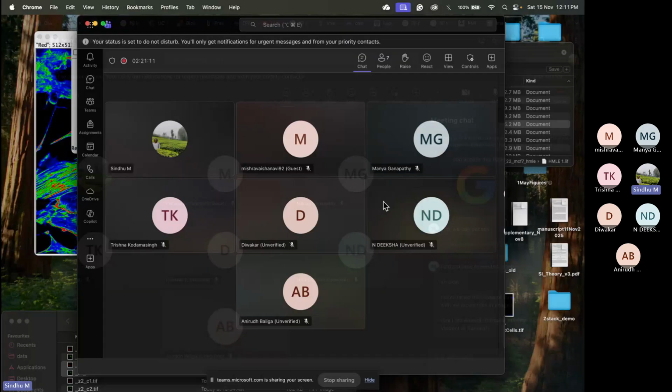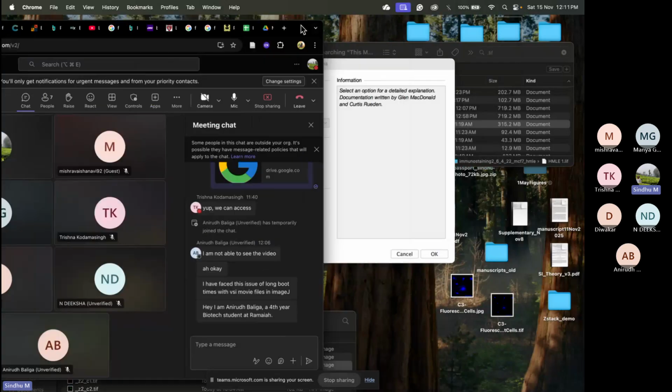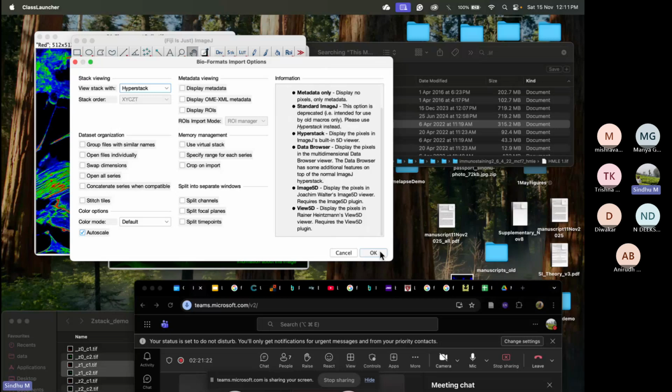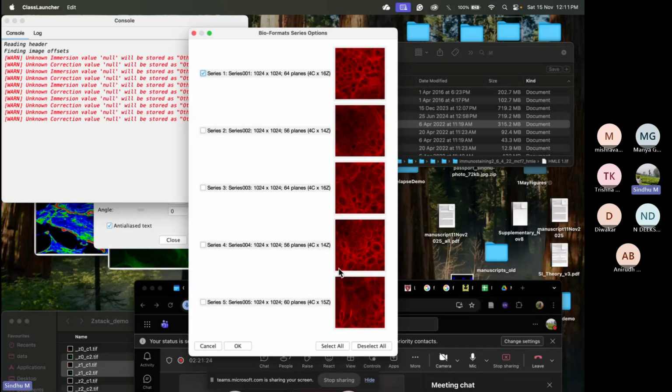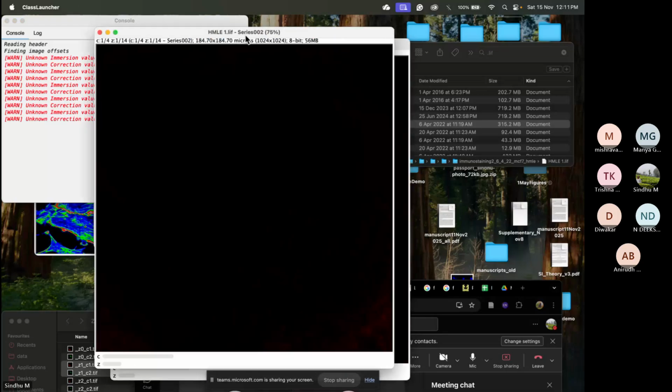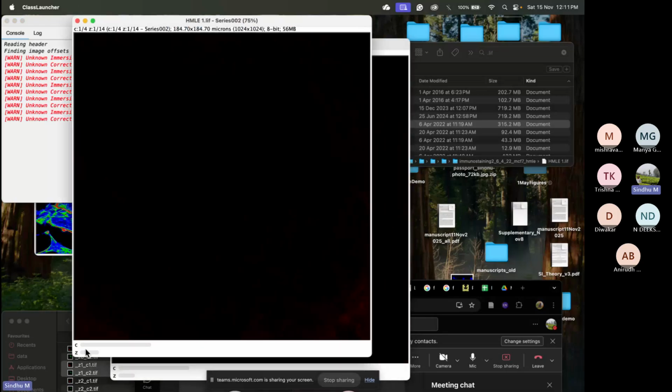Yeah, I think this .lif, it's on. Okay, it has opened. It was on OneDrive, so it took a while to open. And I think this is some image from an immunostaining experiment. So you have 4 channels and 16 Z stacks. So you can select, and there are different positions that were imaged in the experiment. And this is an 8-bit image.